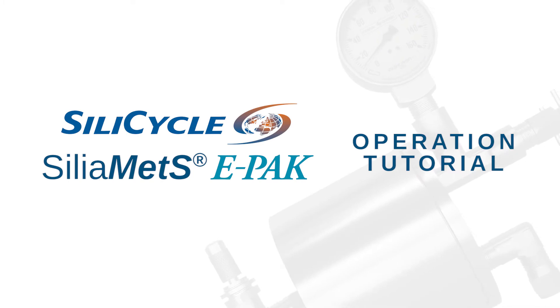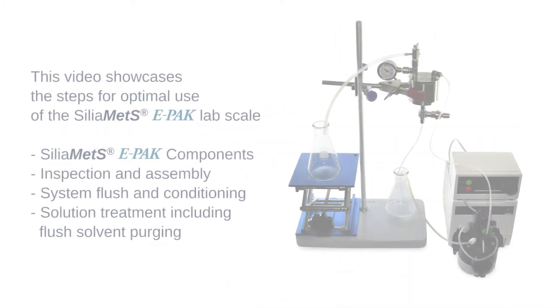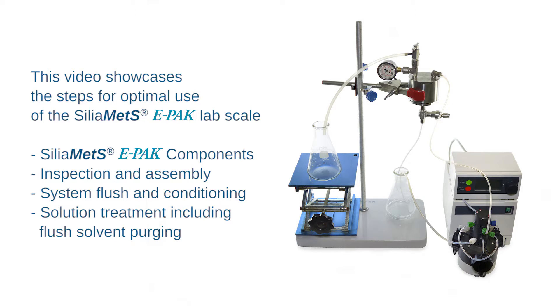SiliaMet E-PAK operation tutorial. This video showcases the steps for optimal use of the SiliaMet E-PAK lab scale.